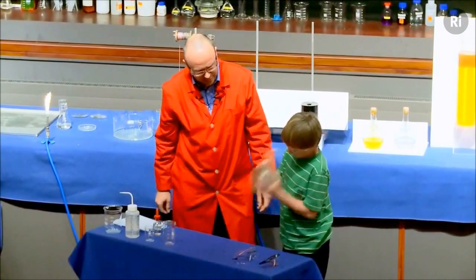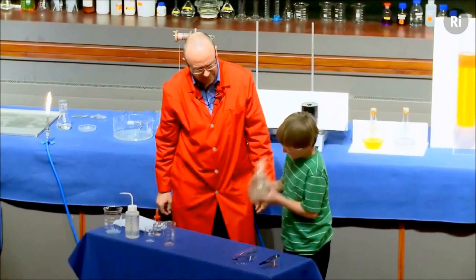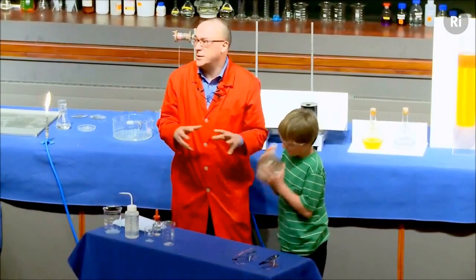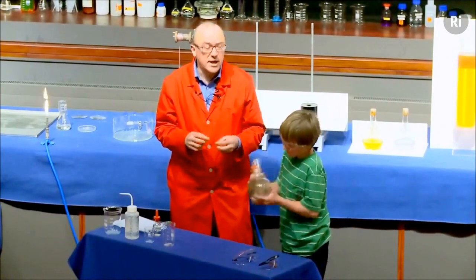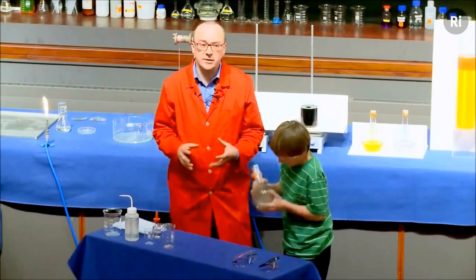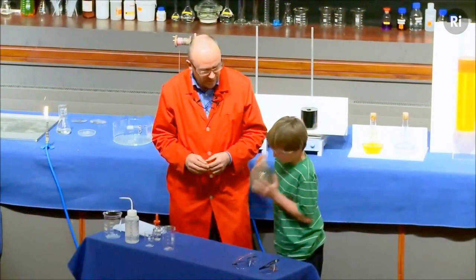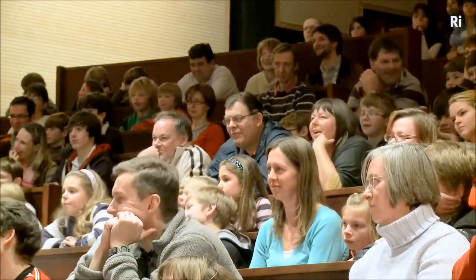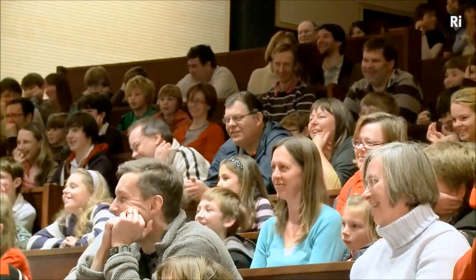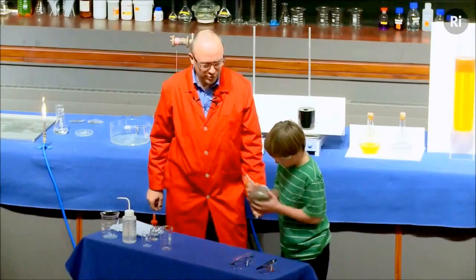That's it, really hard shake. Keep shaking. So what's happening inside this flask now is there is a chemical reaction taking place, and it's forming a solid. And the actual material that it's forming is silver. We're making pure silver metal. Keep shaking. It takes about a minute or two, but the harder you shake, the better it works. So keep shaking.